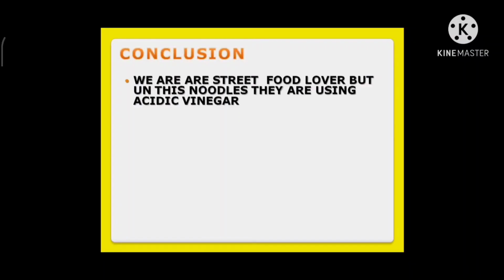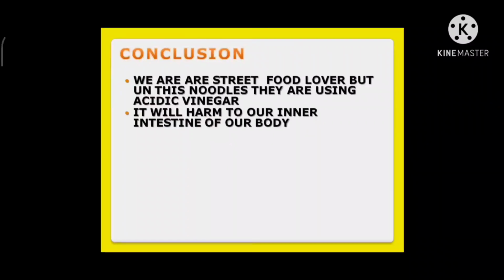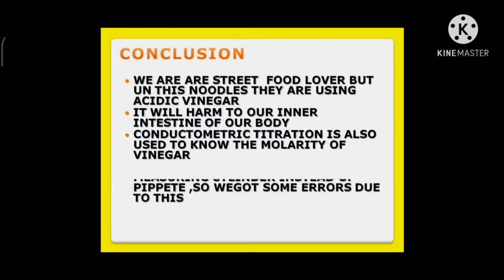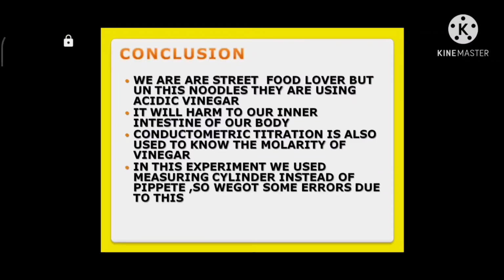Conclusion: we are street food lovers, but in these noodles they are using acidic vinegar. It will harm the intestines of our body. Conductometric titration is also used to know the molarity of vinegar. In this experiment, we used a measuring cylinder instead of a pipette, so we got some errors due to this.